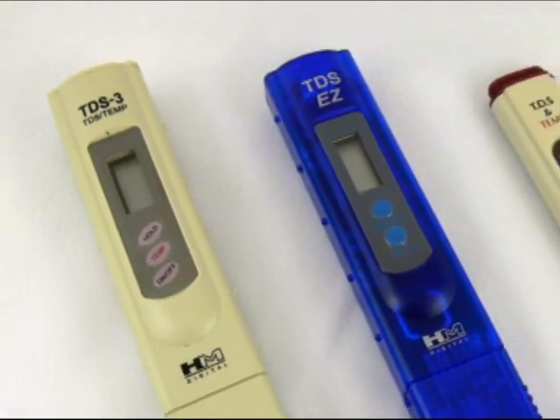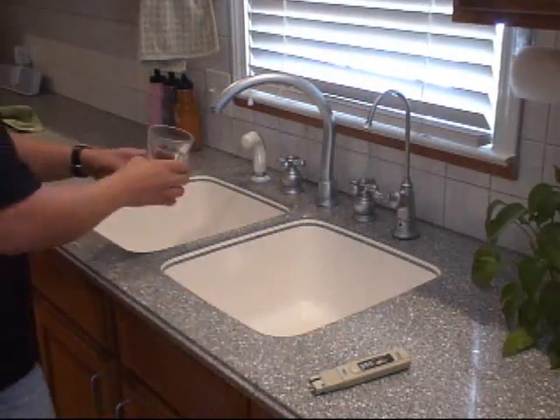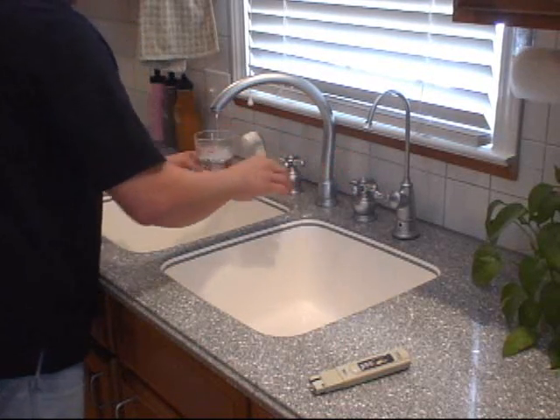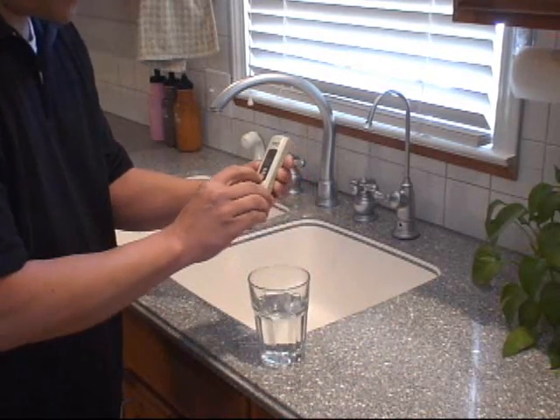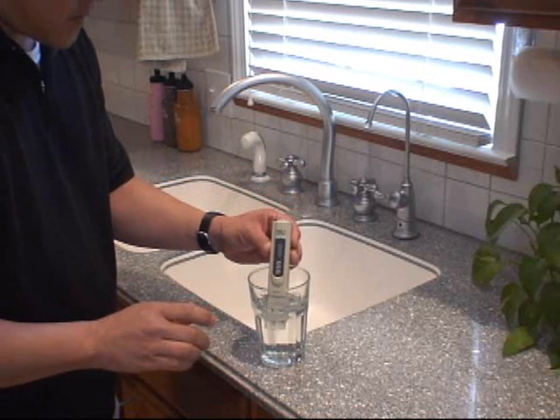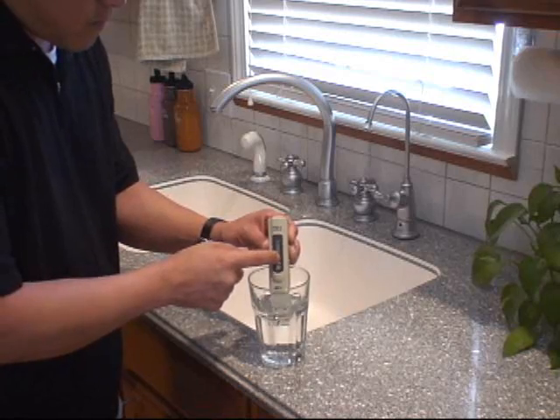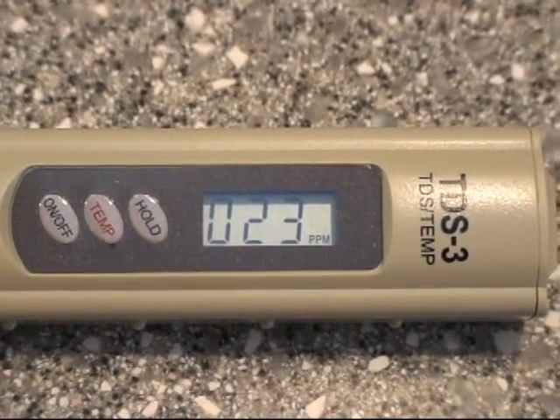FreshwaterSystems.com carries a full line of handheld TDS meters. Fill up your glass of water straight from your kitchen tap faucet. Then, take your handheld TDS meter, press the ON button and place the probes into the glass of water. Press the HOLD button to keep your reading in place. Then, record the tap TDS reading.